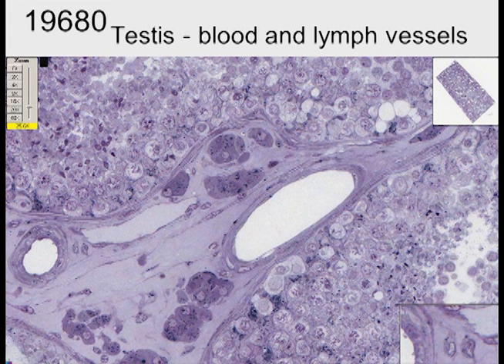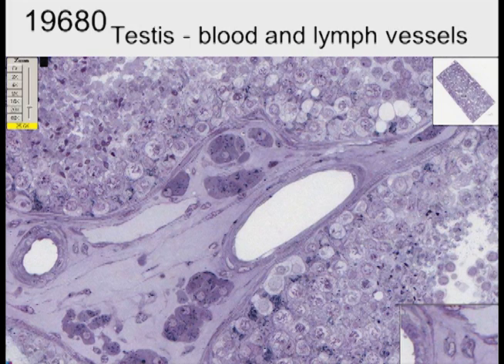Here again, we see a toluidine blue of the human testis, showing you blood vessels, Leydig cells, a host of germ cells in the tubules, the lumen of the tubule, and Leydig cells in the interstitium. The Leydig cells have a very big nucleus with a very big nucleolus. In this case, we see some granularity, and there is some lipid stored in these Leydig cells.